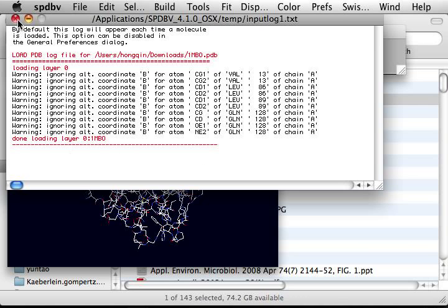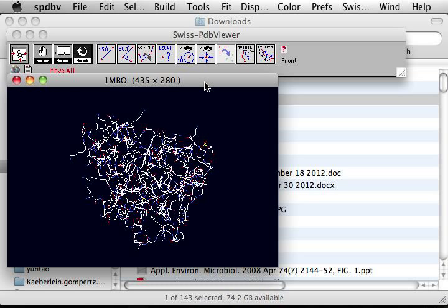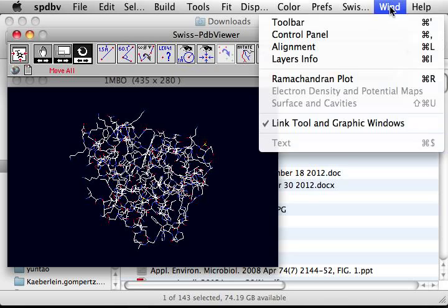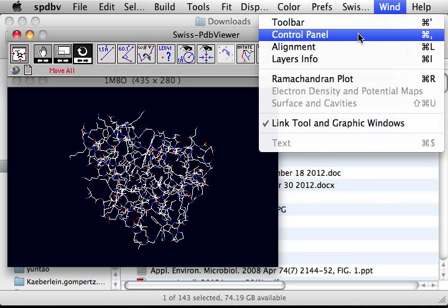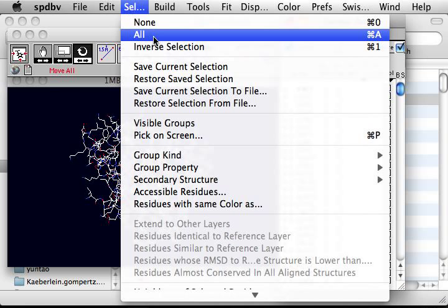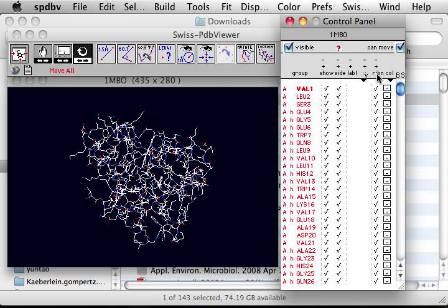This is the myoglobin protein structure. Now I want to open up the control panel. I want to show only the ribbon structure of the protein, so I'm going to select all, then go to the control panel and select ribbons.